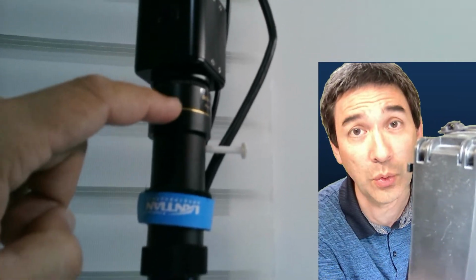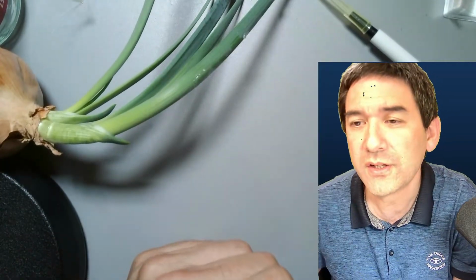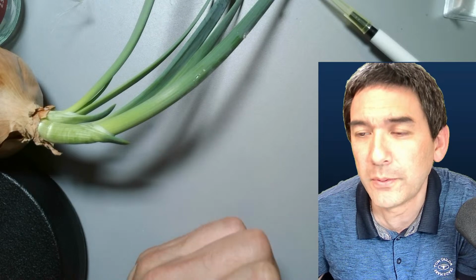This C-mount has to be connected to an adapter. I got this adapter, you can buy this separately, or I got it from another microscope camera. And then the bottom part just plugs either into the trinocular head or instead of an eyepiece. Just to show you, the C-mount is significantly smaller. Just to clarify this, because this is also often a question that arises. I have to be careful that I don't miss any questions here. Lots of microscope camera questions.